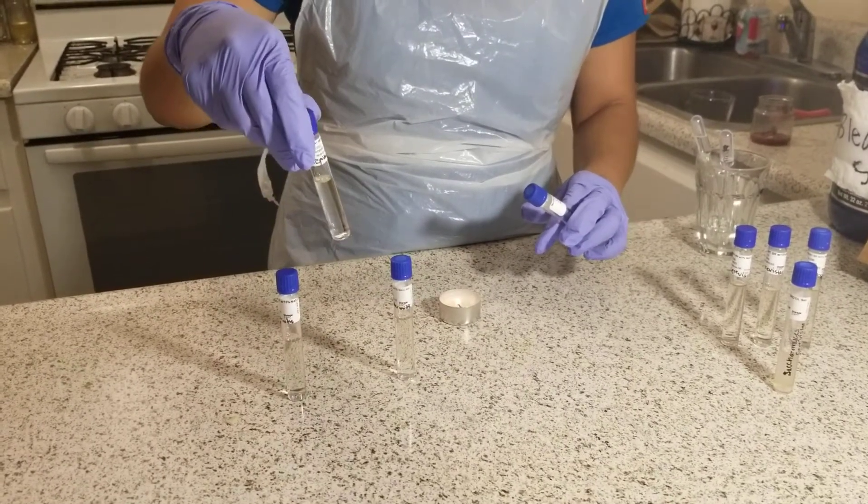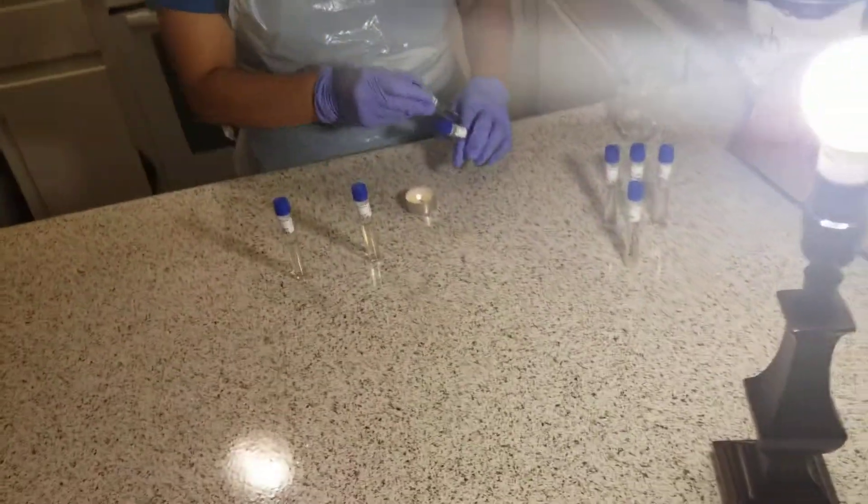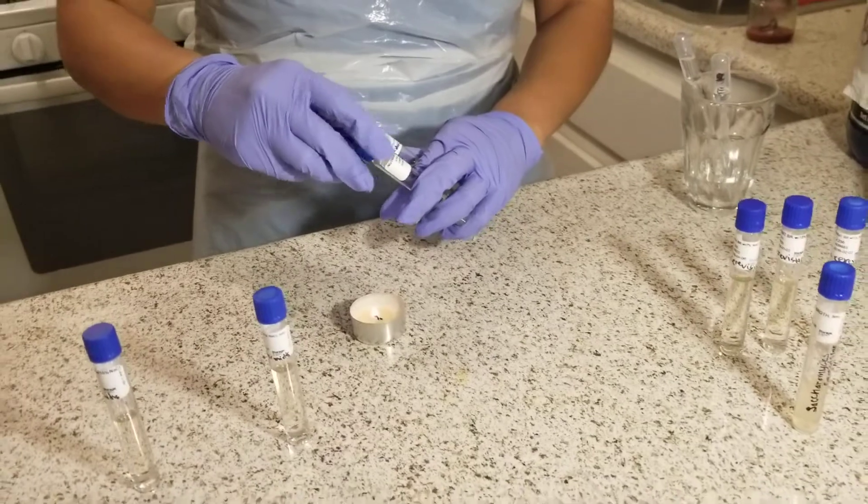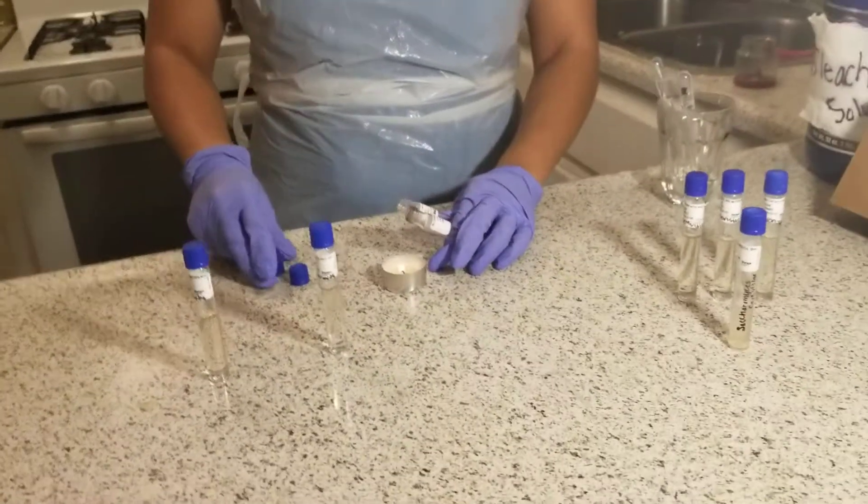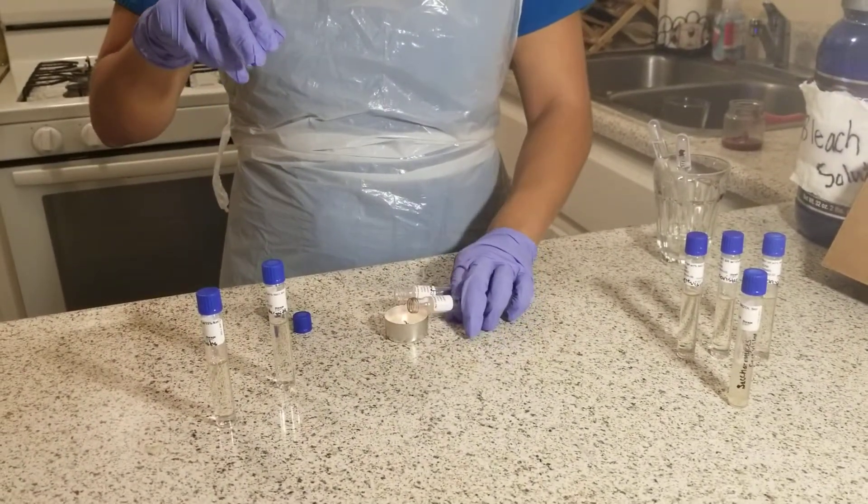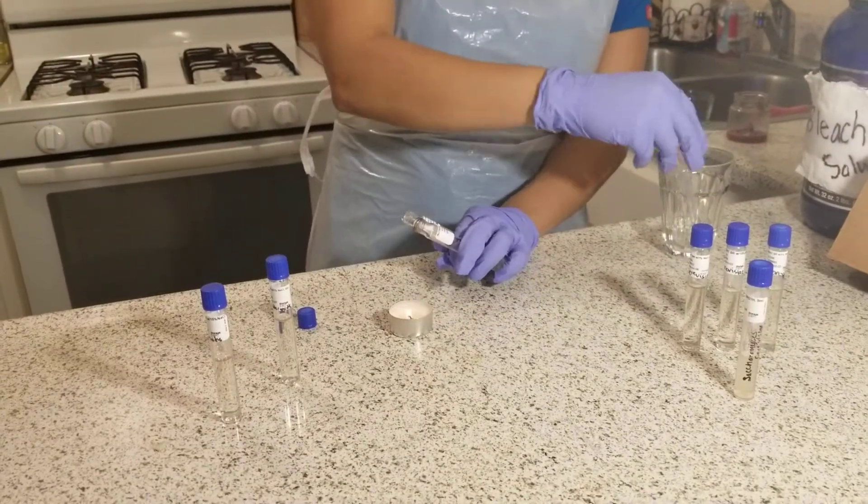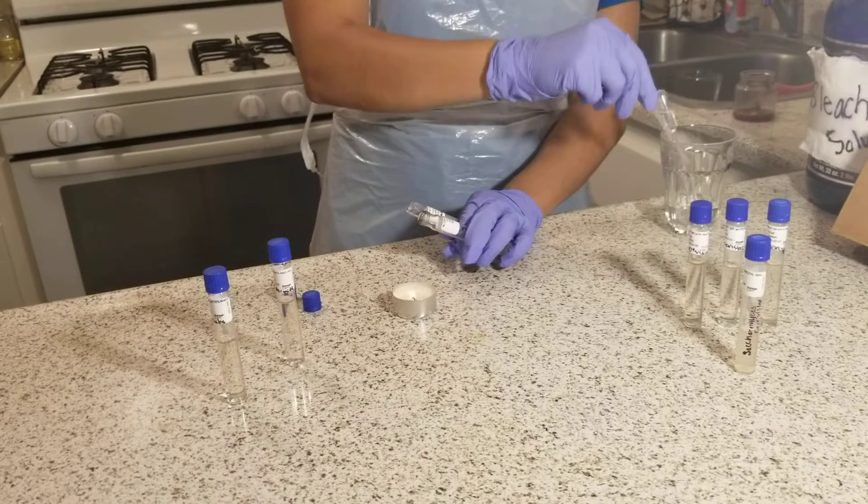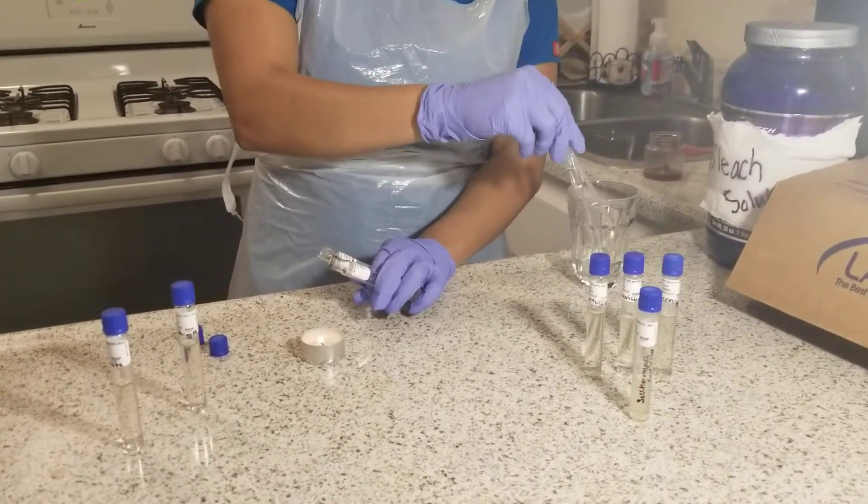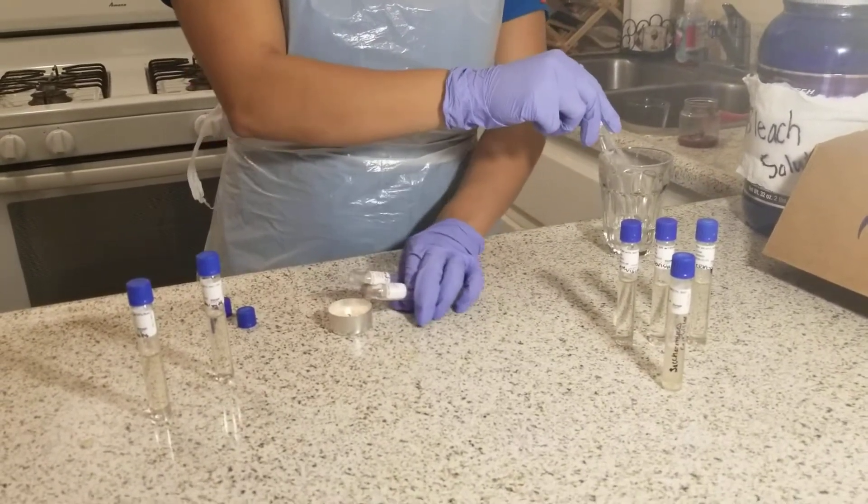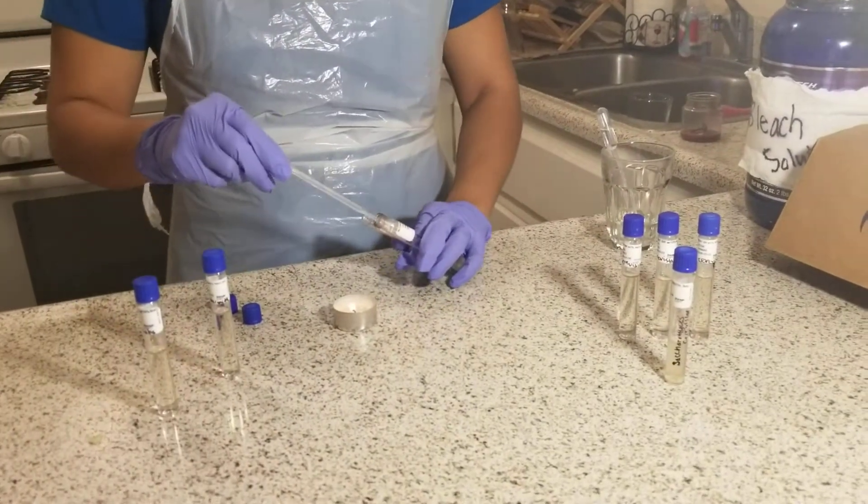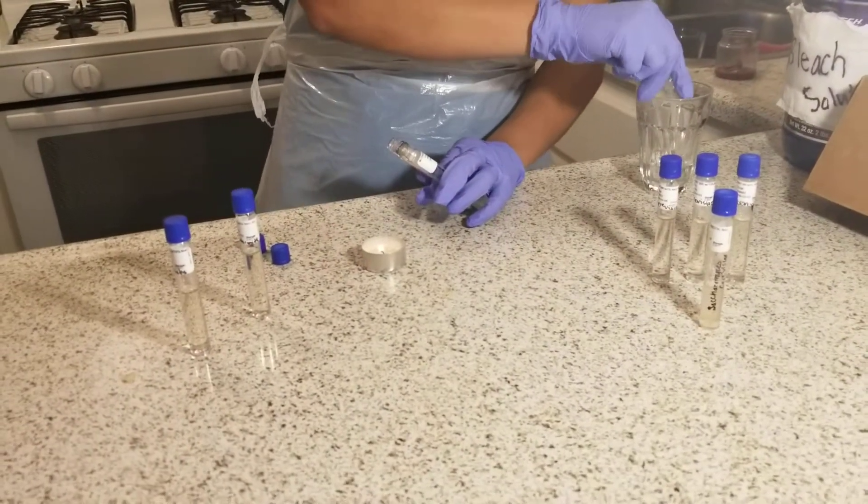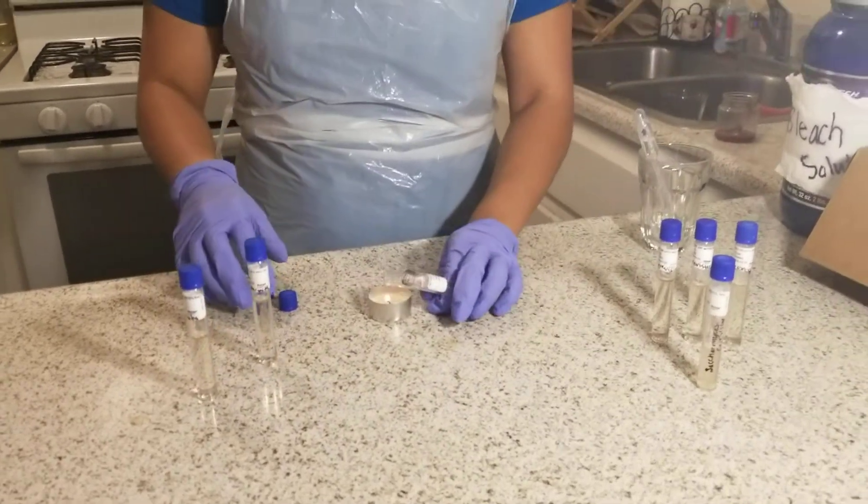Next, I'm going to grab my 5% sodium chloride tube and do the same. Passing both tubes over the flame to sterilize. I'll dry my pipette, then collect 2 drops of the microbe and transfer them into the sodium chloride solution. Sterilize the lids and recap.